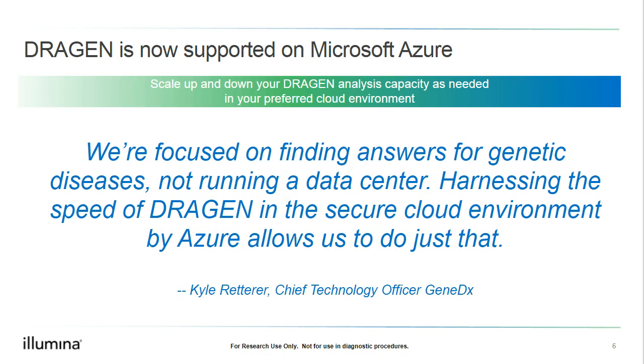existing on-site users, as they are expanding the sequencing that they do and the amount of data that they are analyzing, they've started to run to a point where they're saying that they're spending more time managing the data, running a data center essentially, versus trying to find answers for genetic diseases.